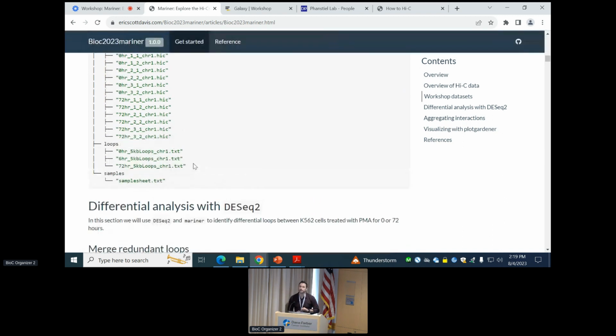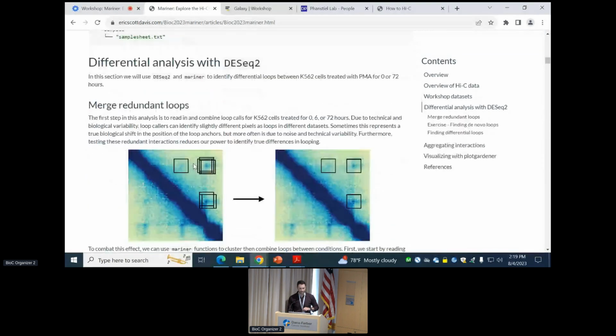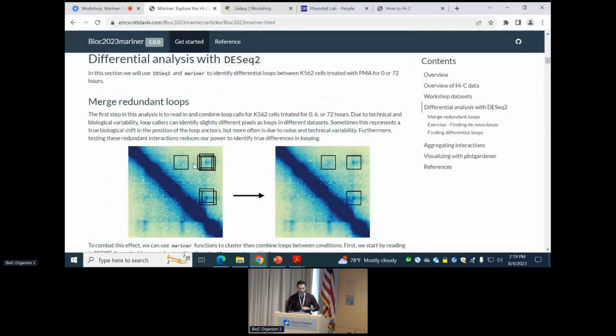If anyone is running the workshop, there's one of the first code chunks. If you can go ahead and hit play on that, it's going to go out and download the data from the S3 bucket where it's hosted. Should only take a few seconds to download there. While that's loading, let me know if anyone's having any trouble getting that data.